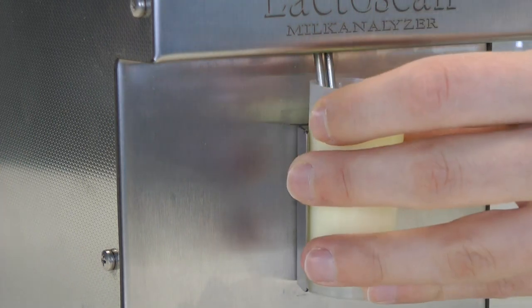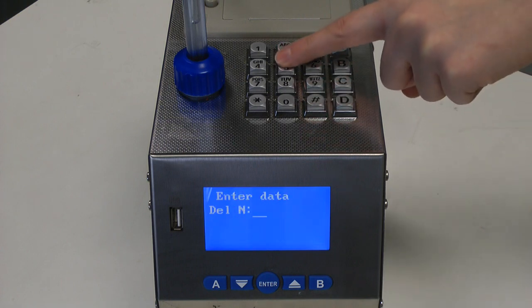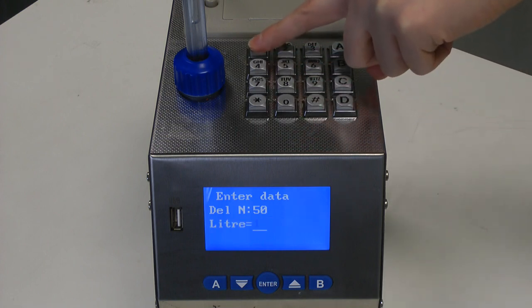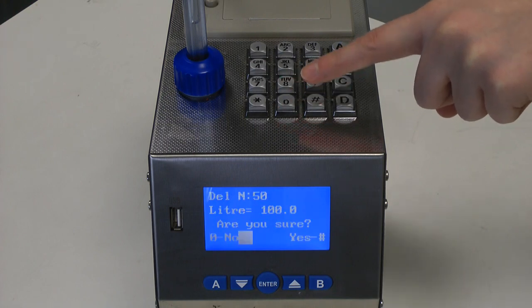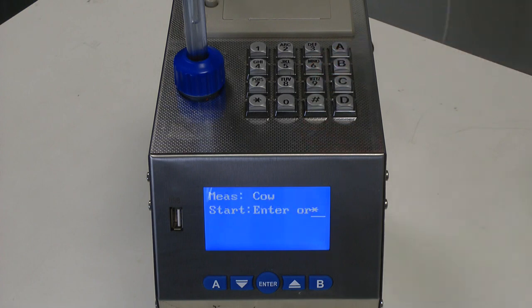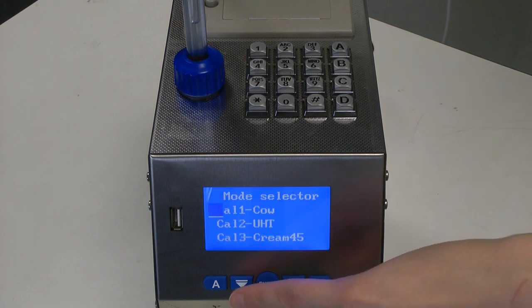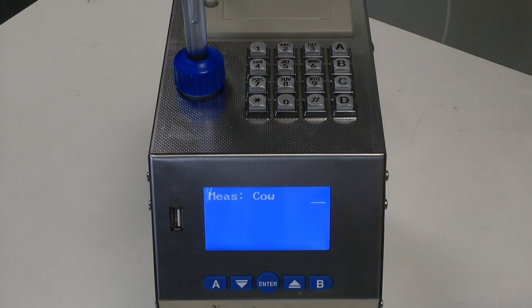To enter number of the milk supplier and the liters delivered, do the following. Press this button on the keypad. Display starts showing. Enter the number of the supplier. By pressing the same button, the display shows Liters. Enter the Liters and press again the button to confirm the entered data. Press the button Enter and hold it pressed. Display shows release button to start menu. Release Enter. Now, the possible working modes are displayed. With buttons up and down, choose the working mode and press Enter.